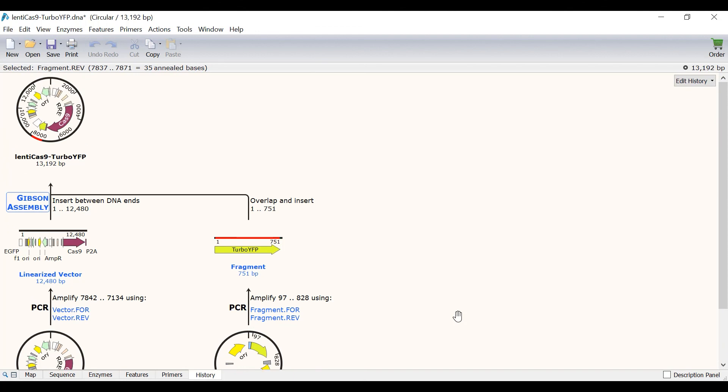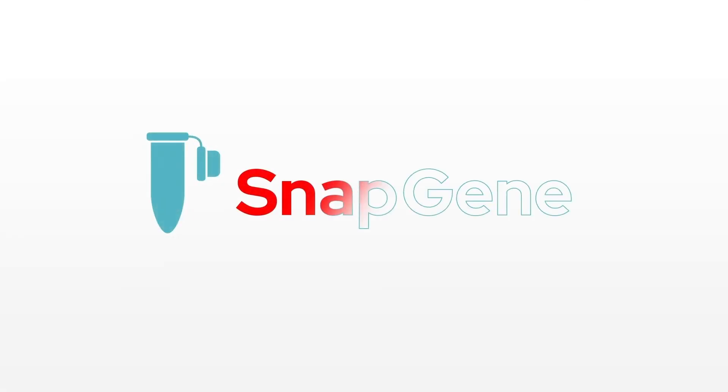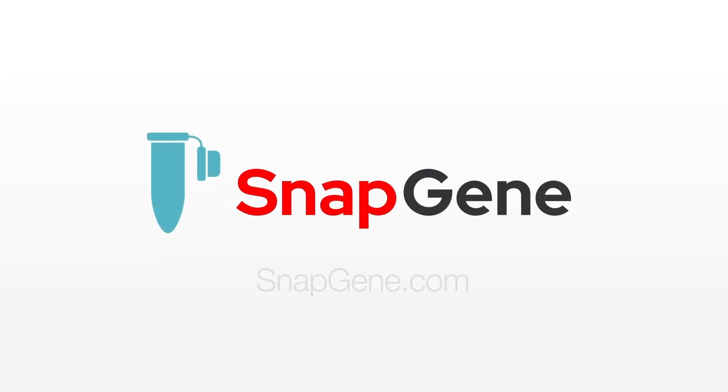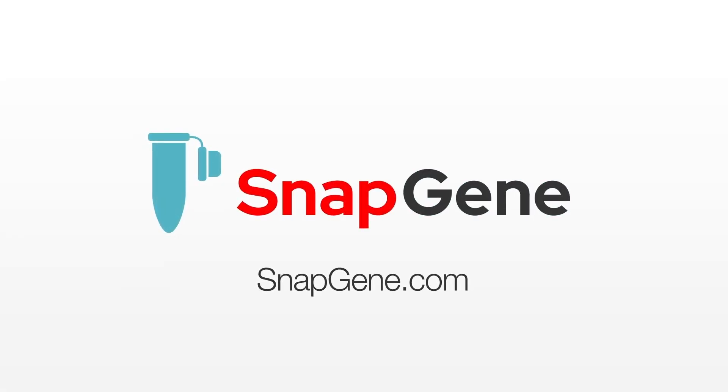And that brings me to the end of this tutorial. In this tutorial you have learned how to use SnapGene to simulate a Gibson assembly cloning procedure with a single fragment. For more information about simulating other cloning techniques in SnapGene, check out the tutorials on the SnapGene website.